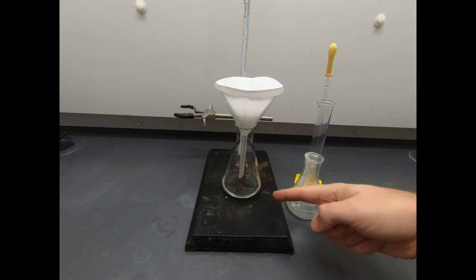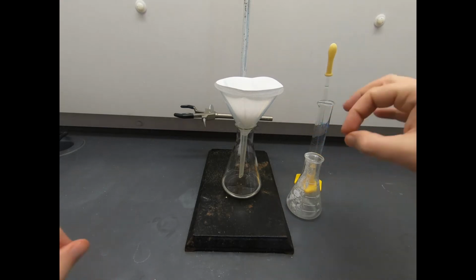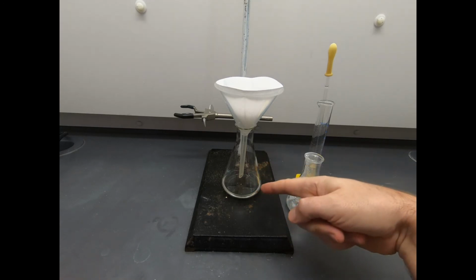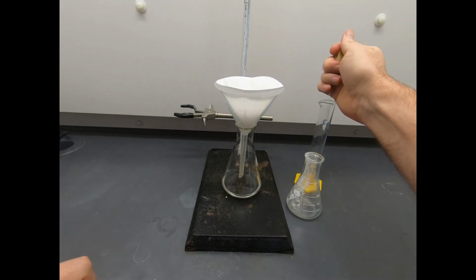But if we use a whole bunch of isopropanol to rinse everything out, get everything spick and span and clean, then we're probably not going to get as good a precipitation when we add the water. So we need to very judiciously use our isopropanol.